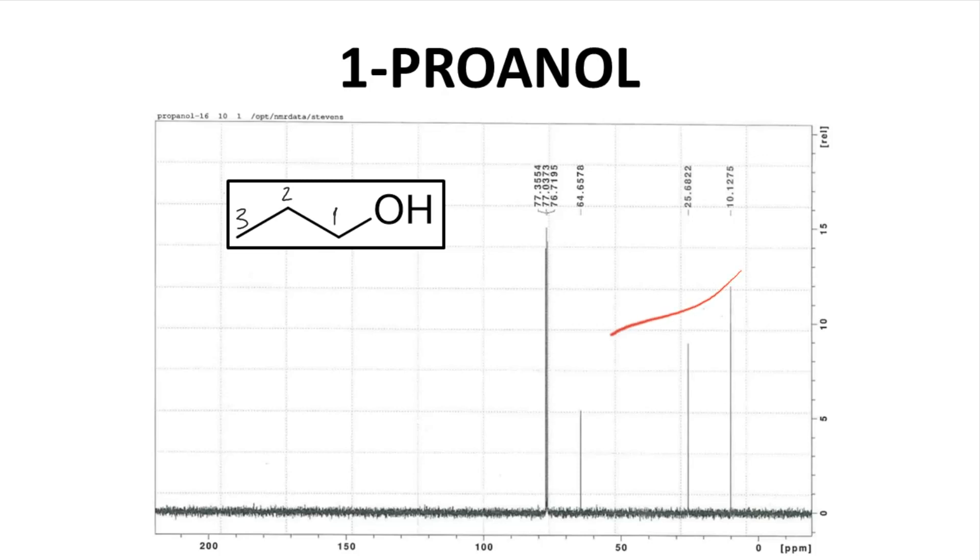We see these three carbons, three peaks, and all these signals have a chemical shift less than 77 as expected based on their hybridization. Note that the signals do not have a uniform intensity, so these three peaks do not have the exact same size and can't be integrated in the same way as a proton NMR spectrum. This is a nice simple molecule with a simple C13 spectrum.